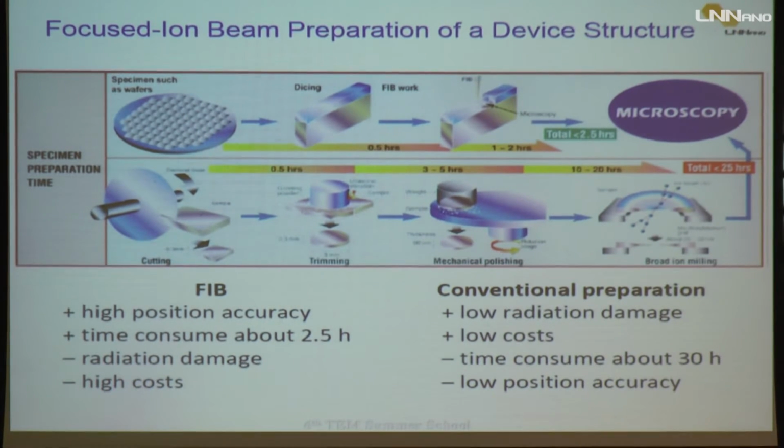And in the conventional preparation, you have low radiation damage and low cost, but you need a lot of time to work on your sample, and you have no accuracy related to position. It's very poor in this possibility. Okay?